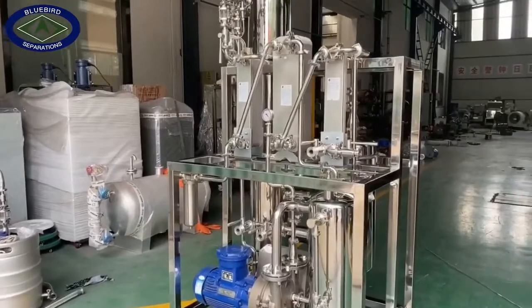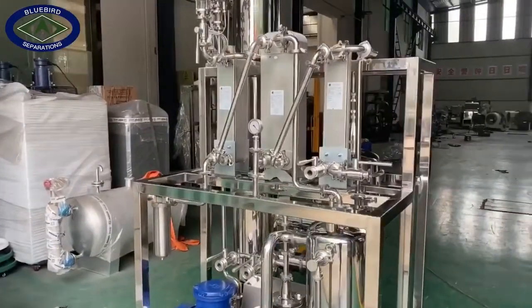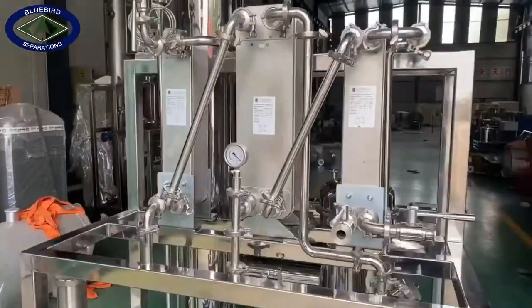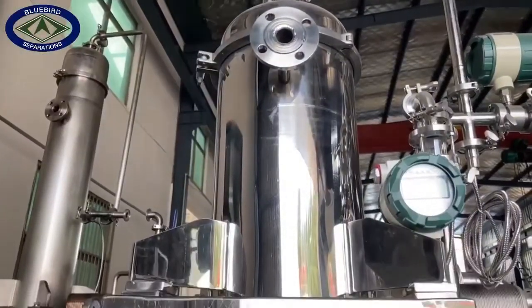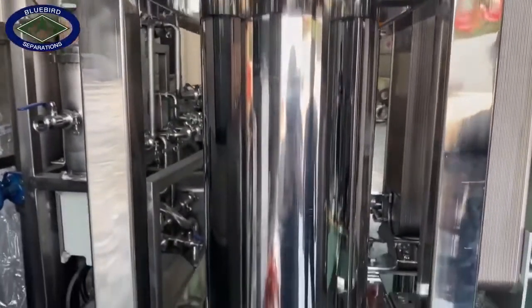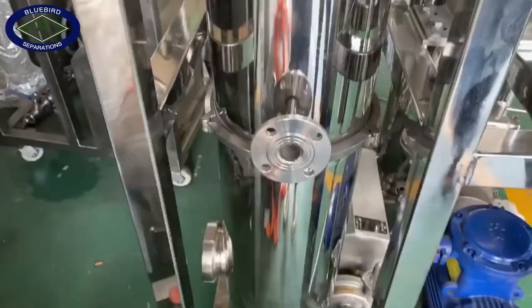This is our star product, a falling film evaporator. It's used to extract and evaporate cannabis and other plants. It uses oil heating instead of steam heating, with the highest temperature up to 300 degrees Celsius, which operates more stable.